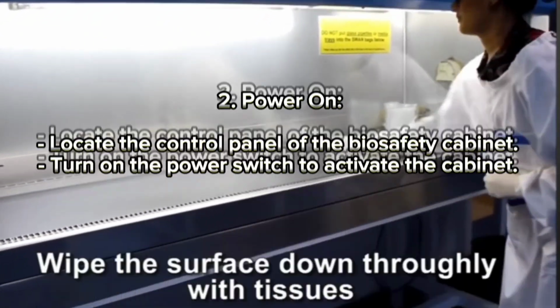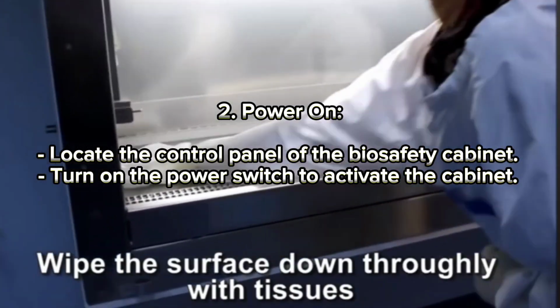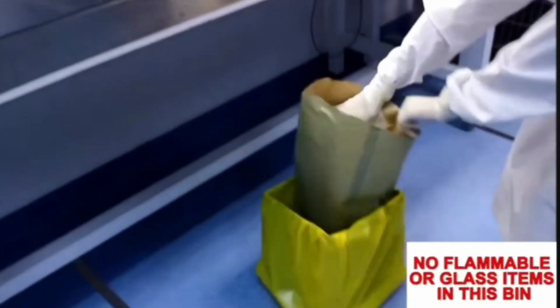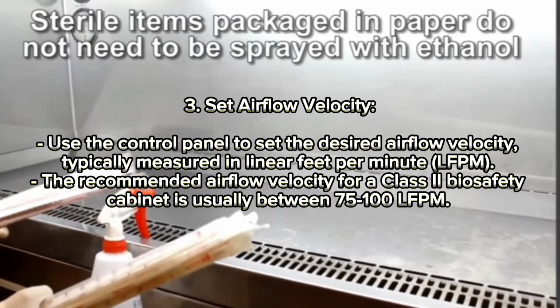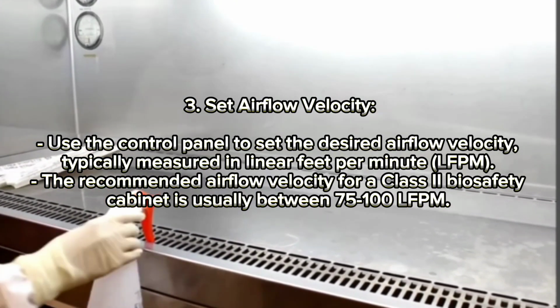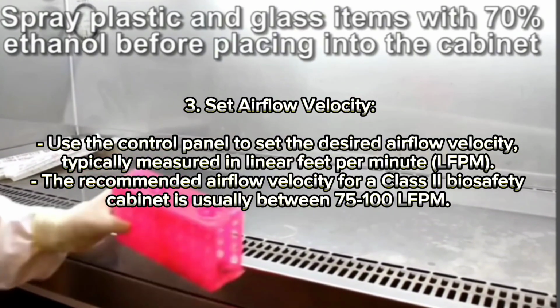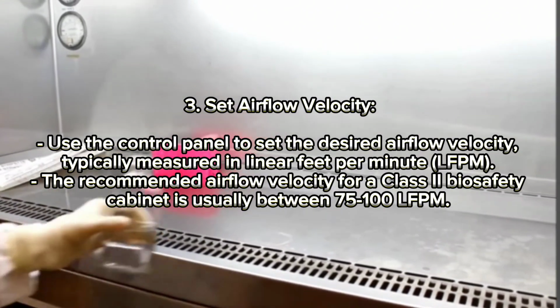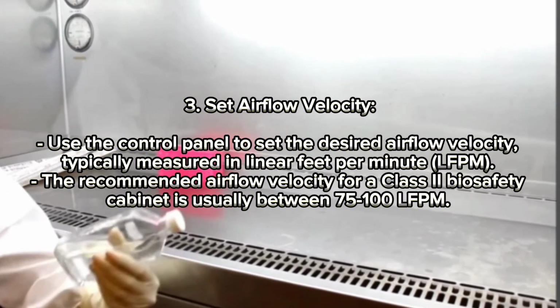Plug in the power cord of the biosafety cabinet to a properly grounded electrical outlet. Second is power on. Locate the control panel of the biosafety cabinet. Turn on the power switch to activate the cabinet. Third is set airflow velocity. Use the control panel to set the desired airflow velocity, typically measured in linear feet per minute. The recommended airflow velocity for a Class 2 biosafety cabinet is usually between 75 and 100 LFPM.